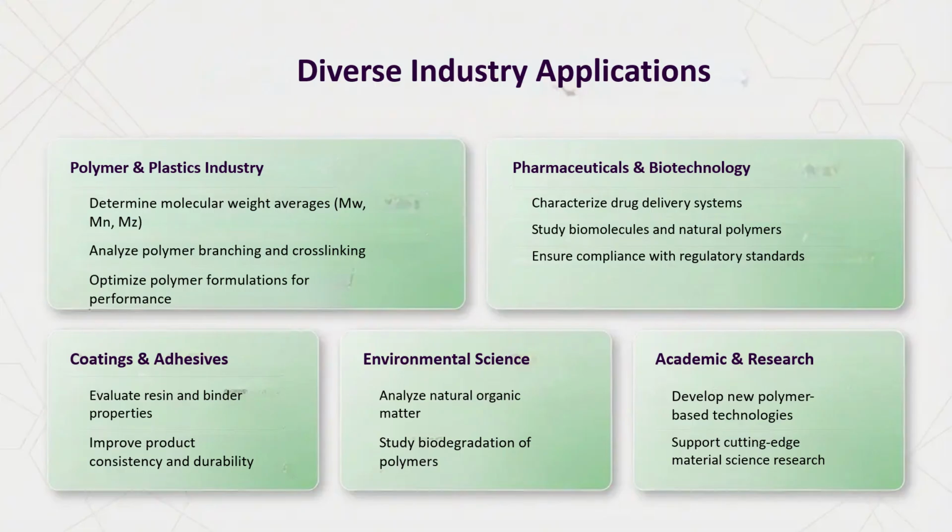In pharmaceuticals and biotechnology, GPC is critical for characterizing drug delivery polymers, pegylated molecules, and even certain biomacromolecules. Regulatory agencies expect thorough molecular weight profiling for consistency and safety. Similarly, coatings, adhesives, environmental science, and academic research rely on GPC to evaluate material stability, degradation behavior, and long-term durability.